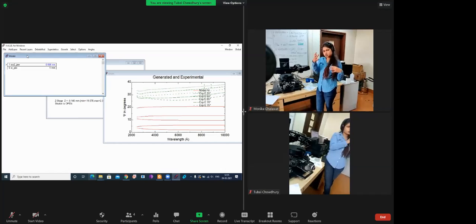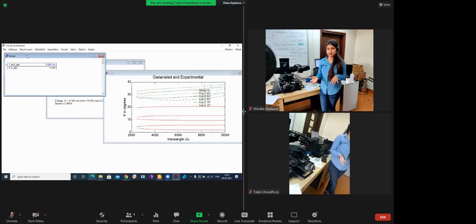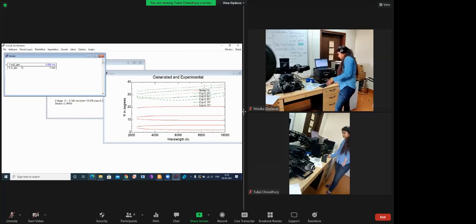Both ways are correct, but both will take extra time because you have to do one fitting and then a second, and there you are fitting two layers together. So we'll try with the first method. We will try both methods.